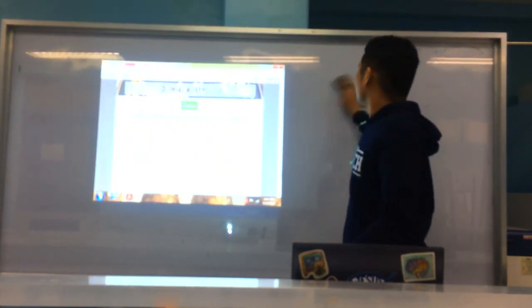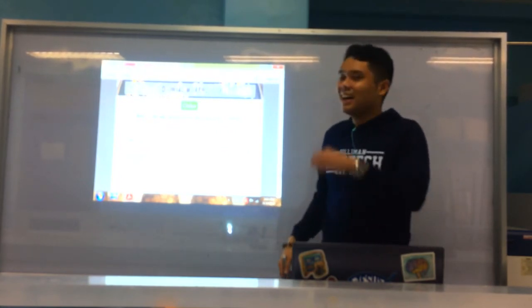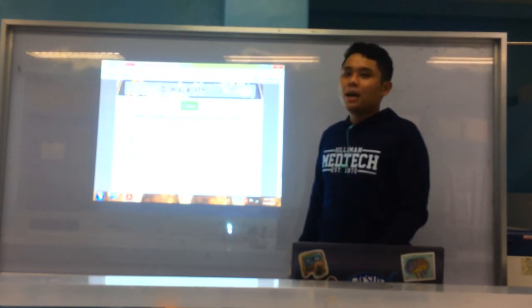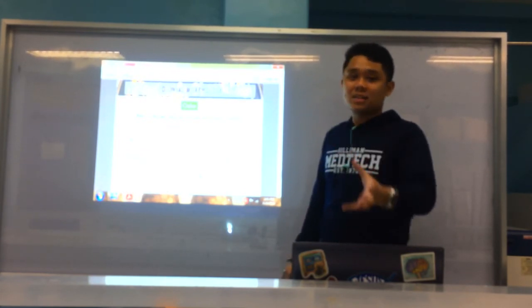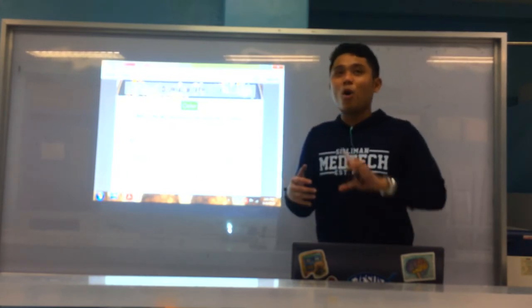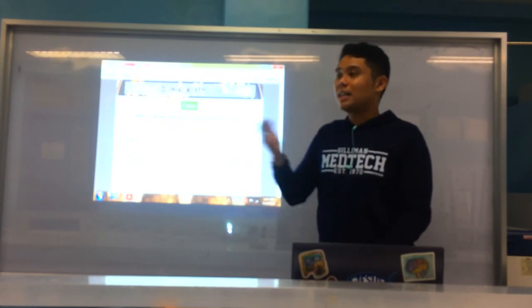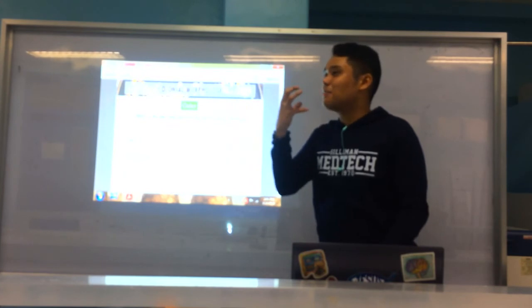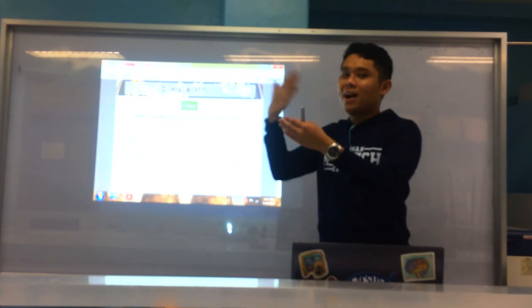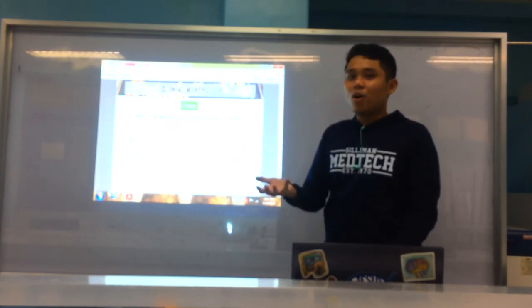And next, odor. You might think odor is only for urine, but it is also for bacteria. Bacteria release characteristic odors because of the different chemicals they release during growth. How do you evaluate odor? As soon as you open the plate, you can smell it. Some RMTs I experienced in the hospital sniff the plate right after opening it, or fan or waft the plate toward them. But again, as soon as you open the plate, the odor is very characteristic.